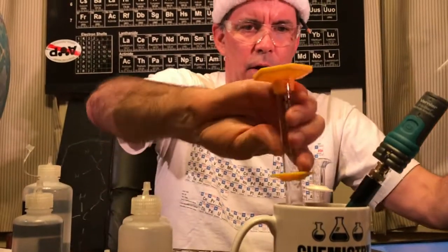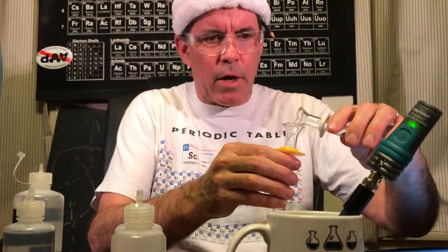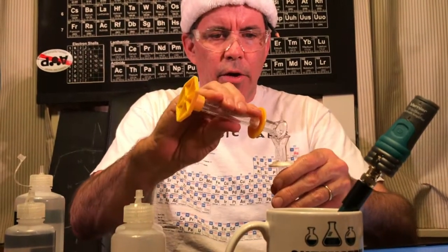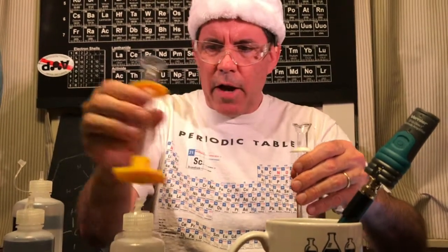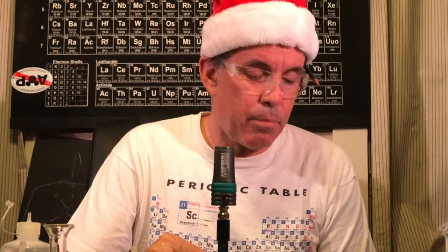Hey, I'm glad I didn't knock anything over. Going to mix it back and forth. Then you're going to do all the calculations. I've provided examples for you in the pre-lab. Okay, we get a pH of 5.04. So now you can write down, hopefully you've collected all that data so you don't have to watch this again, but you can do the calculations and complete the lab on your own. Thank you.